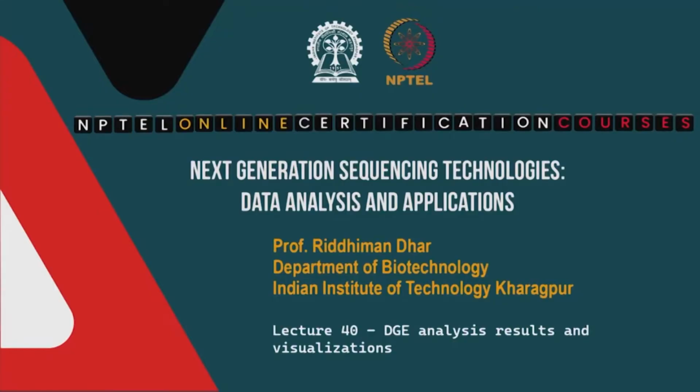In the last class, we started discussing differential gene expression analysis, or DGE analysis in short. We talked about the preliminary concepts and we also started discussion on DESeq2. We have completed some parts, the steps that we need to do for DESeq2 analysis. So, we will continue that discussion in today's class.